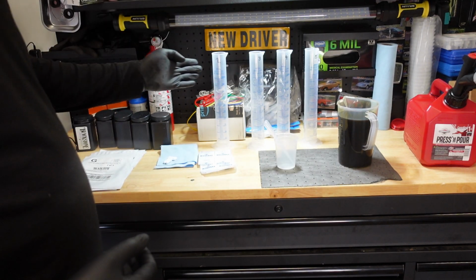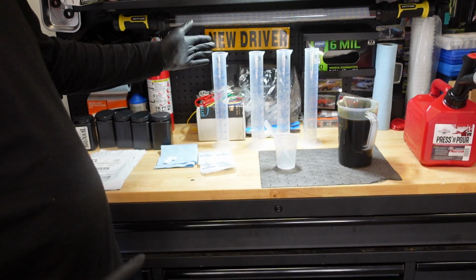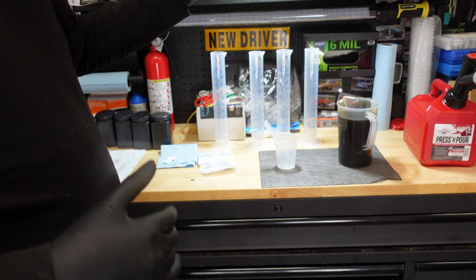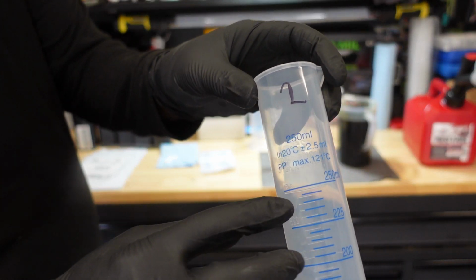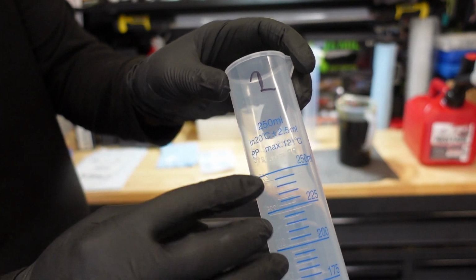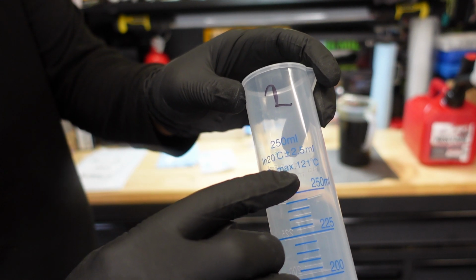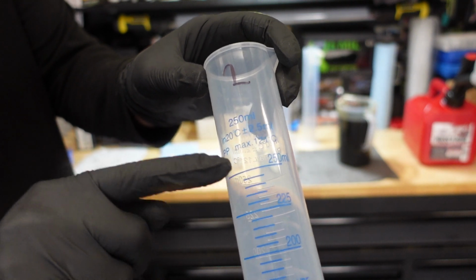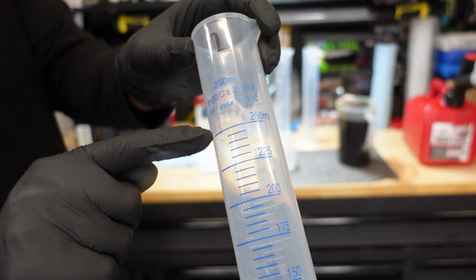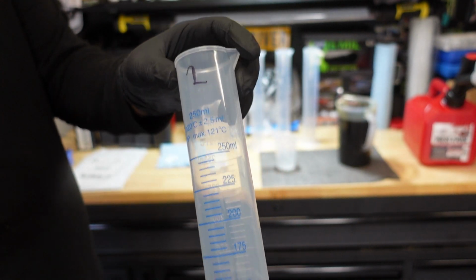Now, why did I choose to do serial dilution versus independent, what you call spikes? This is what you call spiking in the first one. It's because if you look at these graduated cylinders, they're not really that expensive, so they do have a small amount of error, about a 2% spread, about 1% plus or minus at the max volume. So we're going to fill this up to the max volume to mitigate that small amount of error.